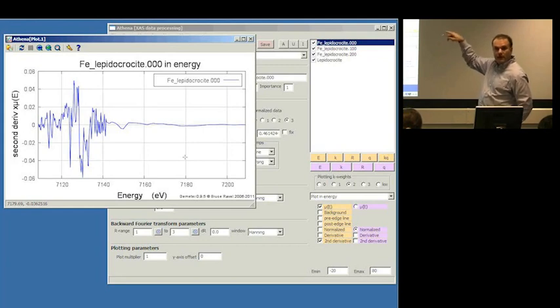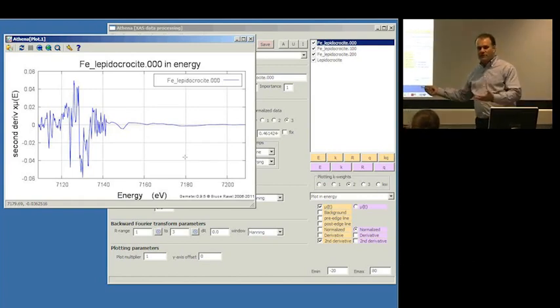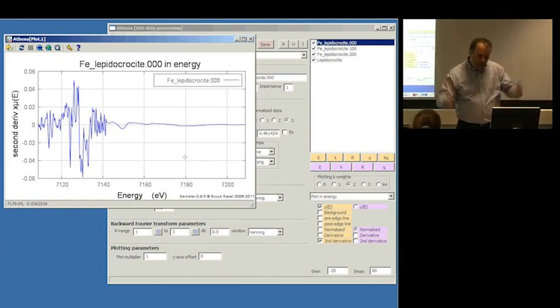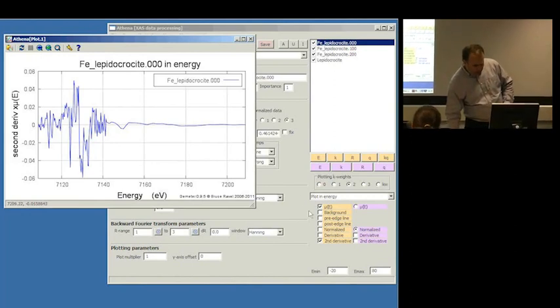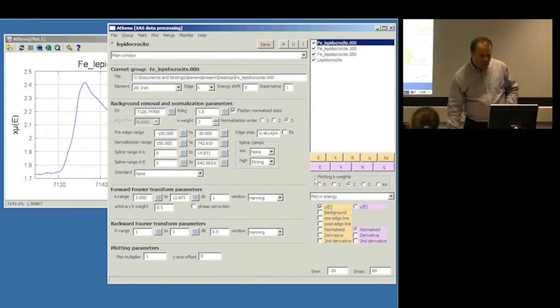So zero crossing of the second derivative is a common criterion that people use, but you have to define it a little bit carefully because there's a lot of zero crossings. The definition is the one that's nearest to its current or its default value. So that's what all the options are. So that's how the value is found for the first one.